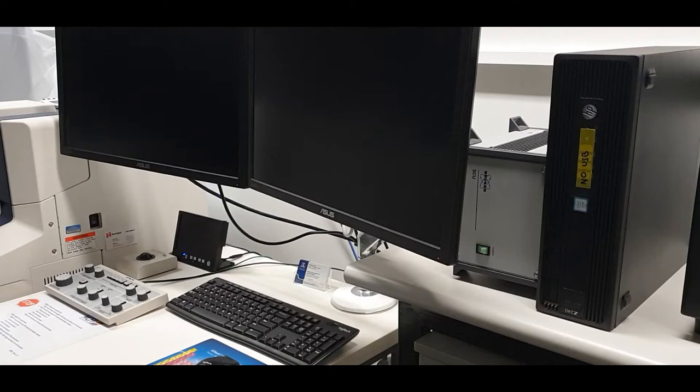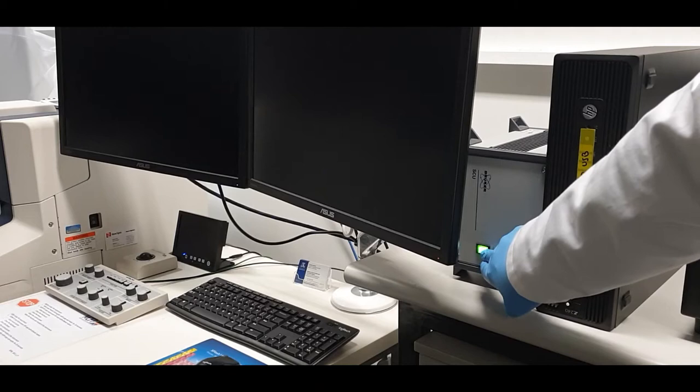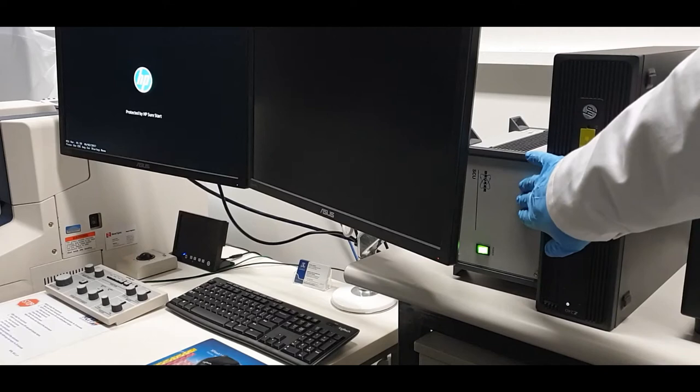Next, turn the computer on if it is not already on by pressing the button on the PC. If you are planning to use the EDX, you can turn the EDX controller on here as well. If you are not planning to use the EDX, you do not need to turn this controller on.